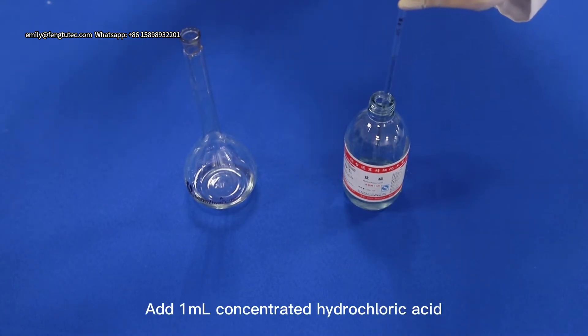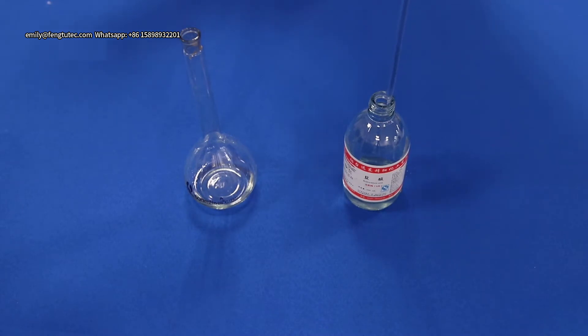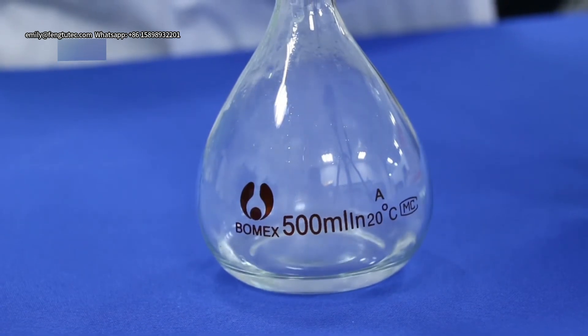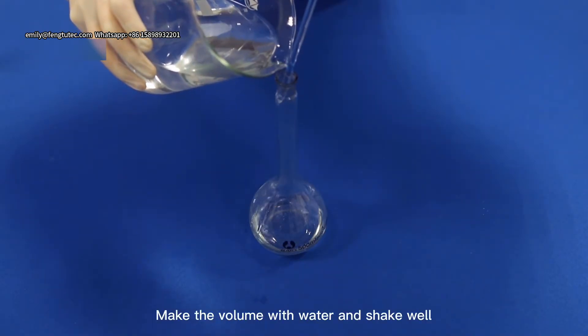Add 1ml concentrated hydrochloric acid. Make up the volume with water and shake well.